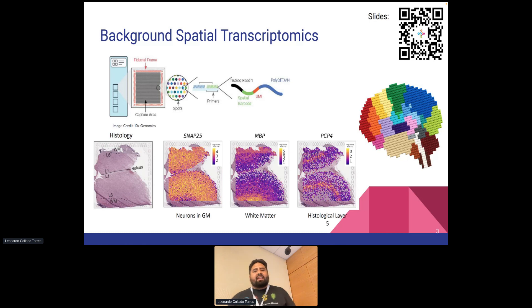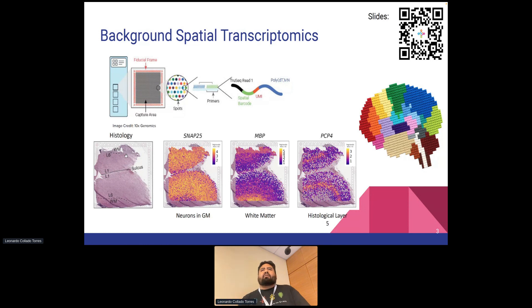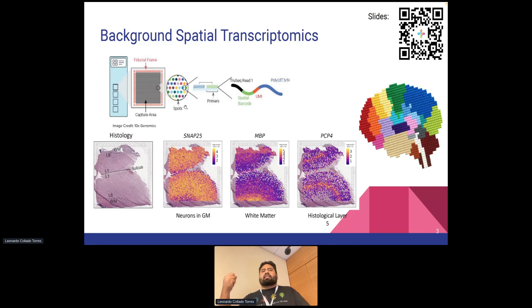For some background on spatial transcriptomics: if you use Visium, which is a particular assay from 10x Genomics, you measure data on spots. There are around 5,000 spots on a 6.5 millimeter square area, arranged in a honeycomb pattern. You can measure gene expression values and generate images for a single tissue slide. It's like a mini bulk experiment because each spot is 55 micrometers in diameter and may contain three to six cells depending on tissue and cell density.